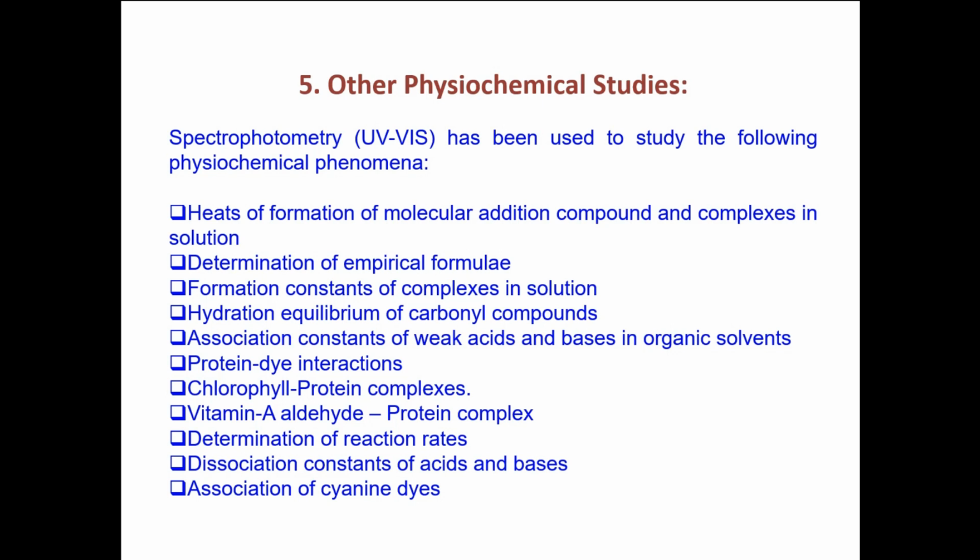These are the different physicochemical studies which have been characterized using UV-visible spectrophotometers. So this is all about the spectrophotometer. Are there any doubts? You can ask me now. Any clarification required?